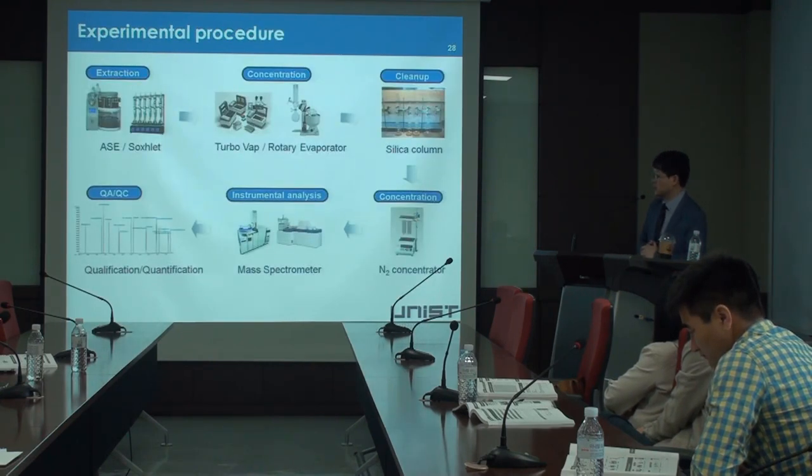Okay? So after collecting the sample, the first step is extraction.